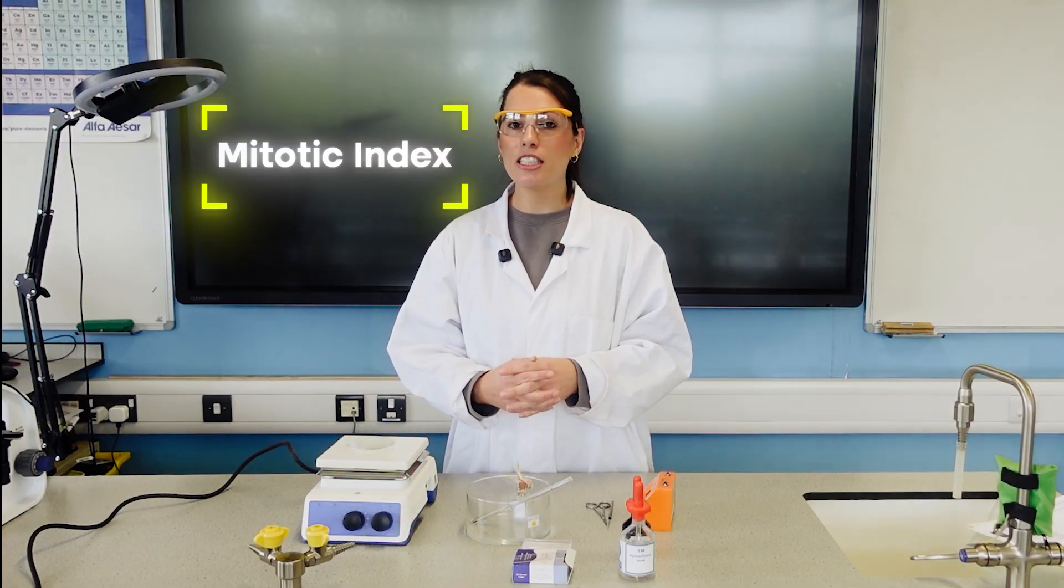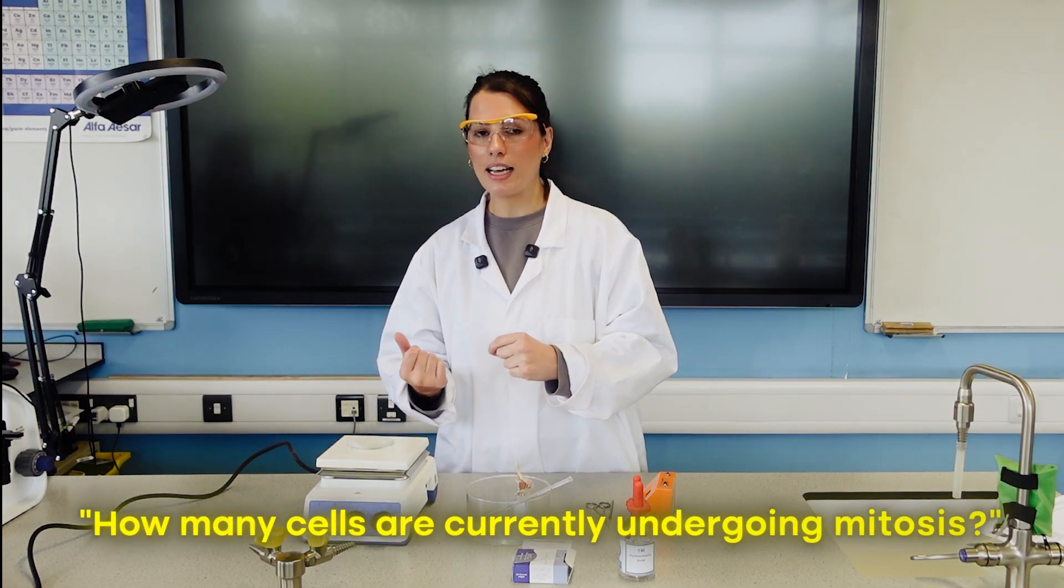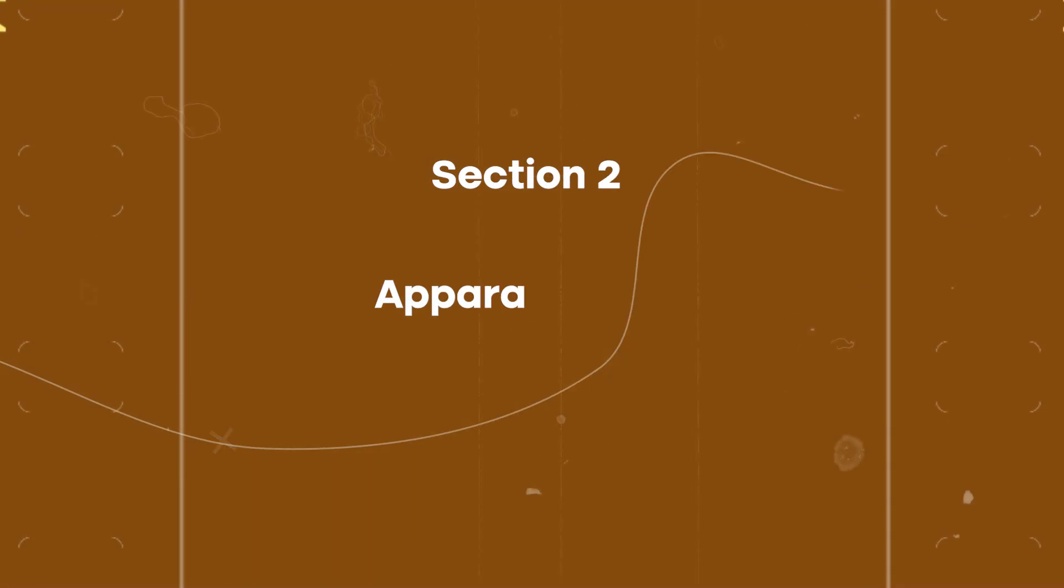Plus it links to that math skill, the mitotic index, where they need to identify how many cells there are in the field of view and how many cells are currently undergoing mitosis. Then they can work that out as a proportion. But before we jump into all of that, let's have a look at our equipment.